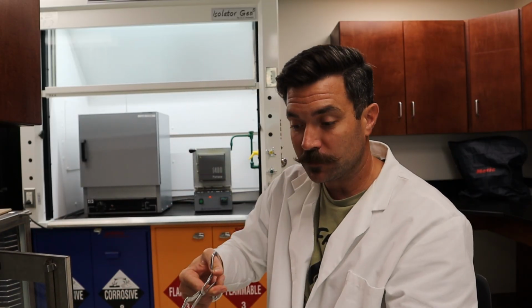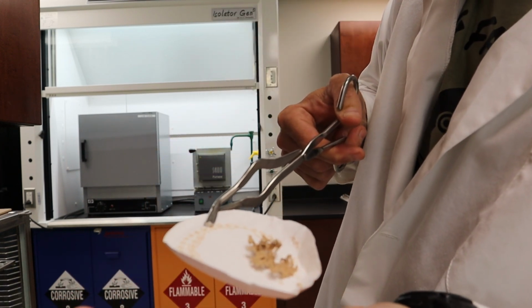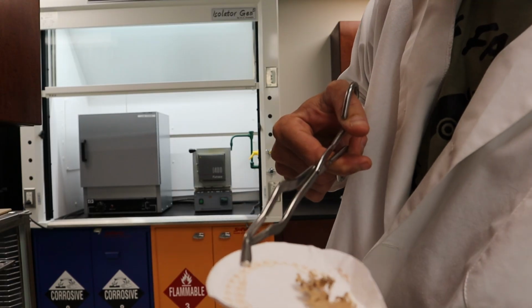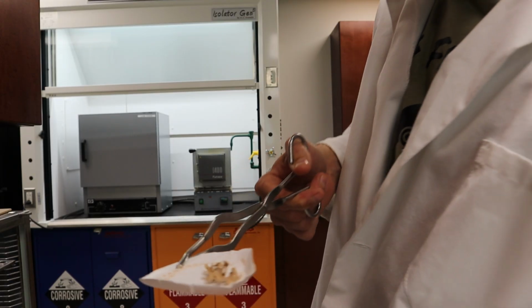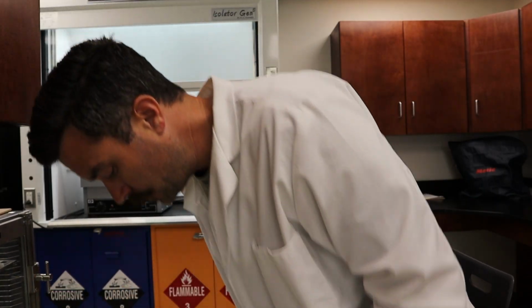You want to see the difference between just dried solids and actually cooked solids that have been ignited in the furnace. A lot lighter brown, cooked off all the organics. We're going to let that cool in a moisture-free environment, again, for 15 minutes. Then we'll throw it back on the balance and crunch our numbers.